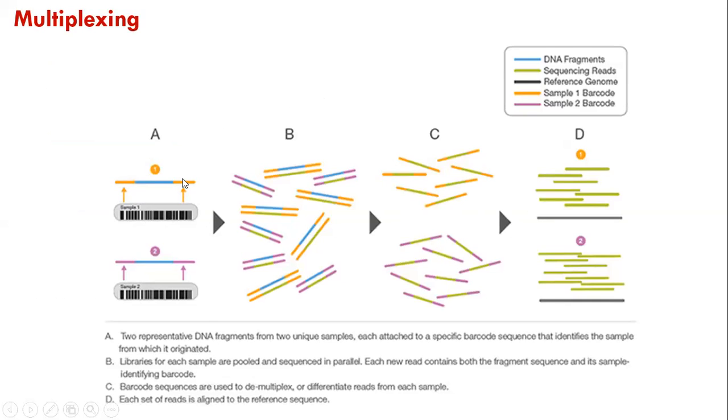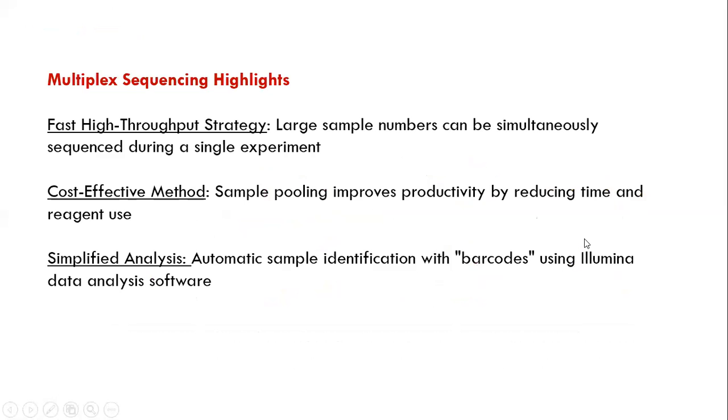You will have DNA fragments with binders, or adapters, and the template DNA. The binders will have barcodes. You see that now you are moving into barcode technology. One binder, a second binder, goes and randomly binds the genome sequences coming from gDNA. Then this is the reference genome sequence, and where these binders go and where they extend, you can run in parallel using the software.